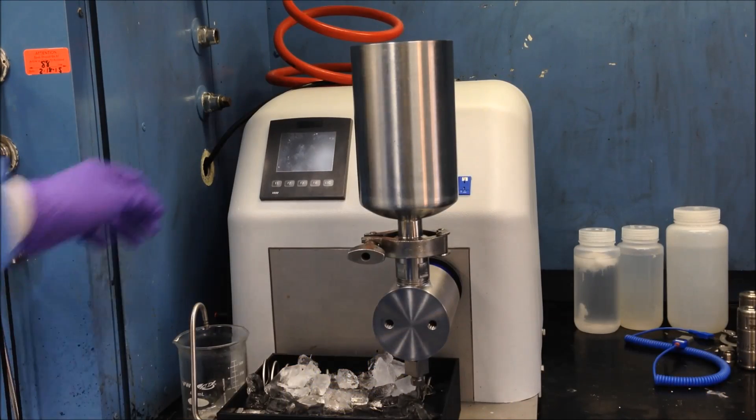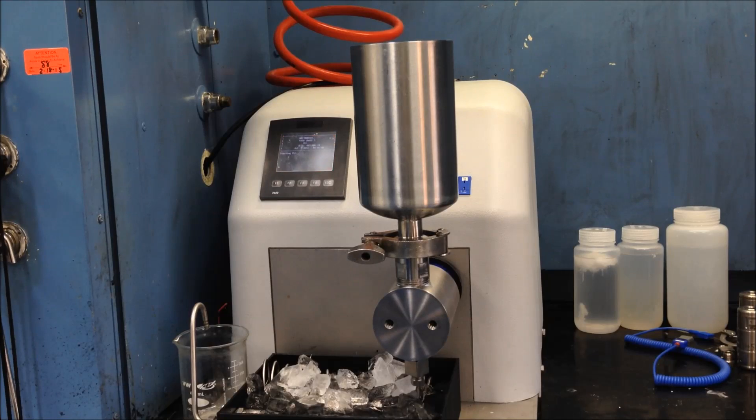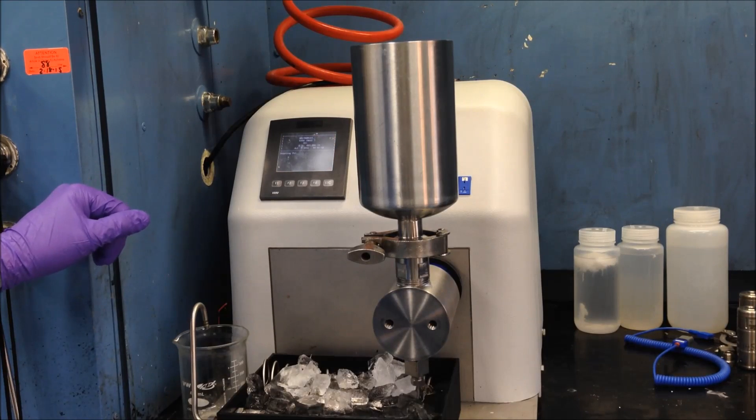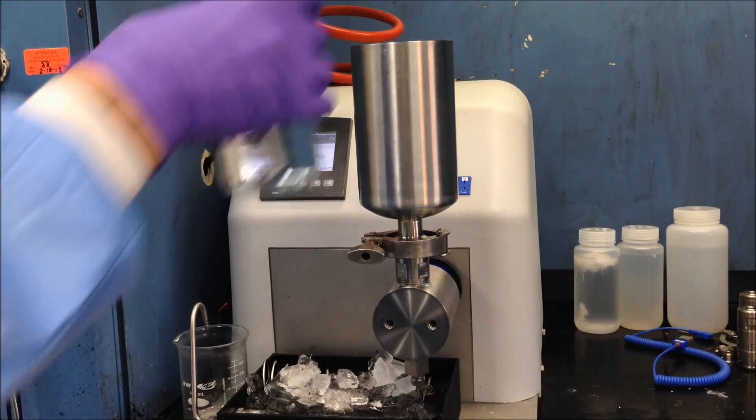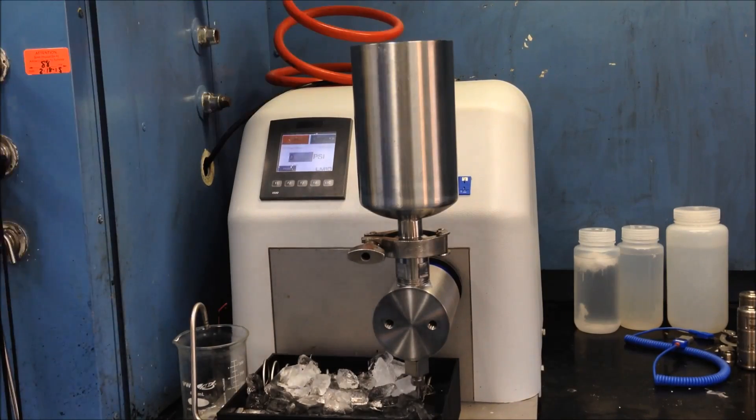To prime the machine, turn the machine on and hit continue on the home page. Once the home page appears, we can add water to the reservoir and press the prime button to remove air from the system.